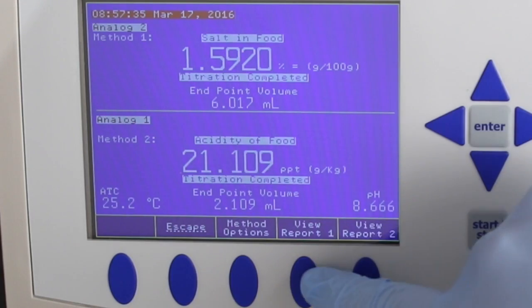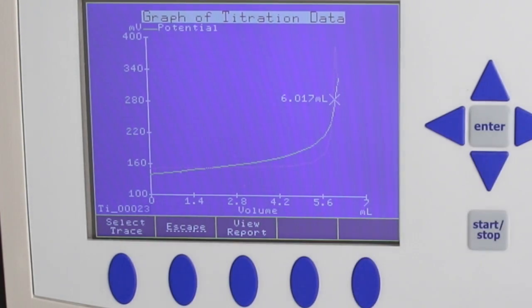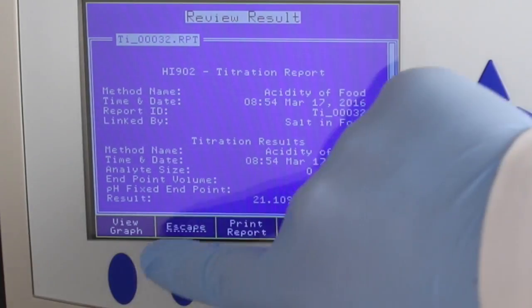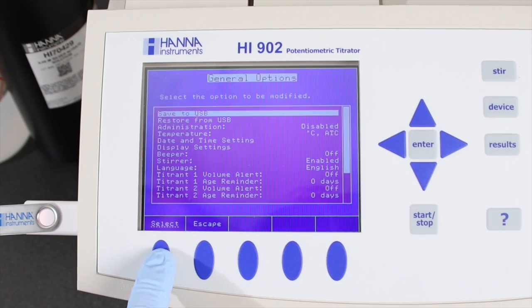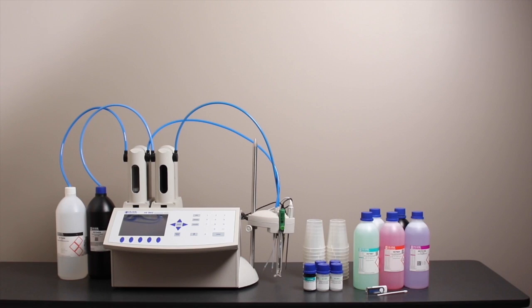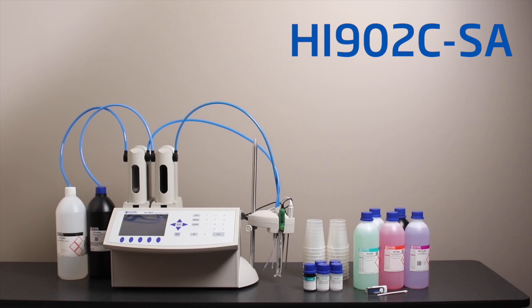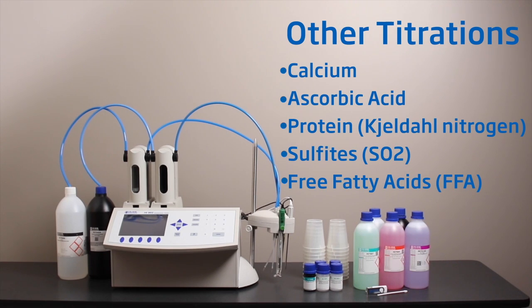Full reports can be viewed directly from the titrator. The reports can be exported via USB drive, PC, or printed directly using a parallel printer. We hope you enjoyed this instructional video.